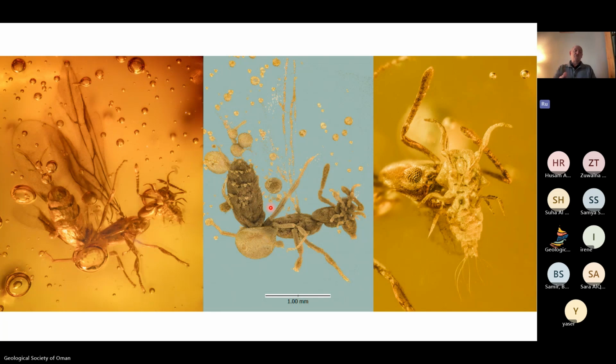And that is a lot of work, because it's not like the pyrite trilobites where you just say, just show me the high attenuation, high density stuff. Here you have to go and do quite a lot by hand. But the benefit is that now you've got a 3D interpretation of the thing. You can go in and measure it very precisely, and you can look at it from any angle that you want, which you can't from the piece of amber. So let's click one more time.